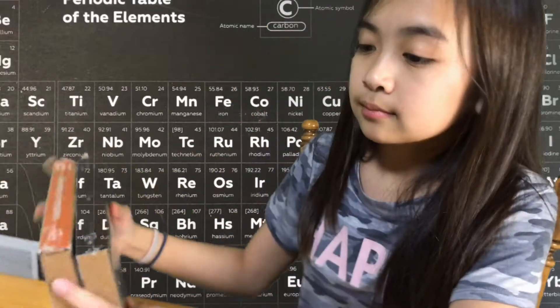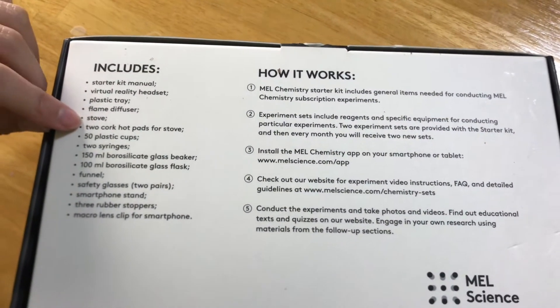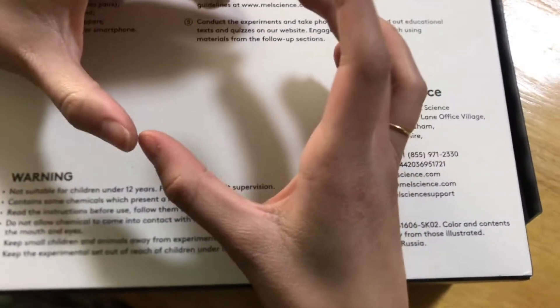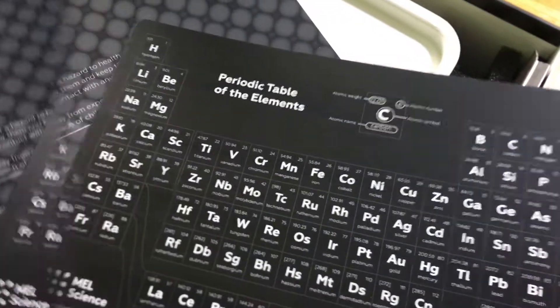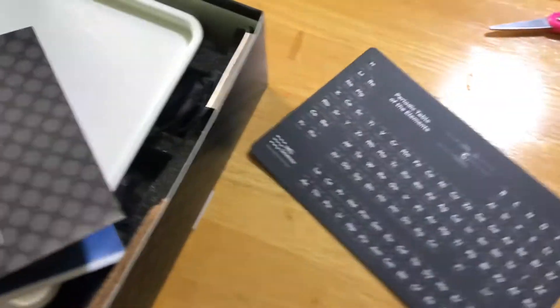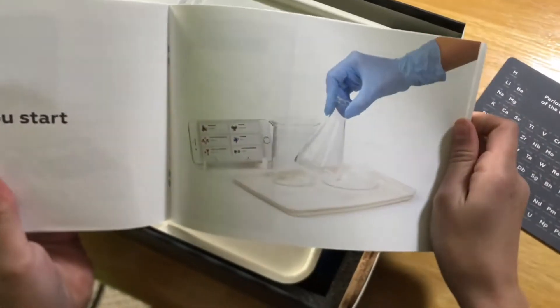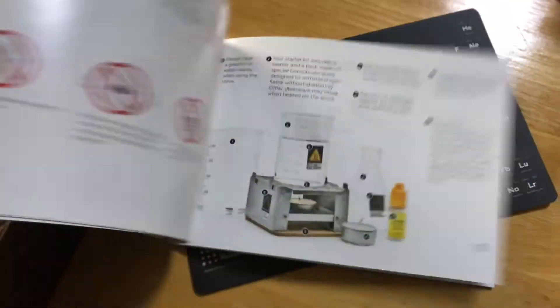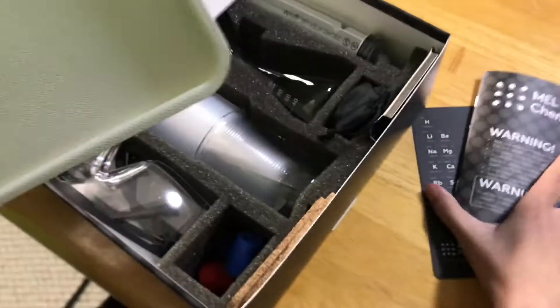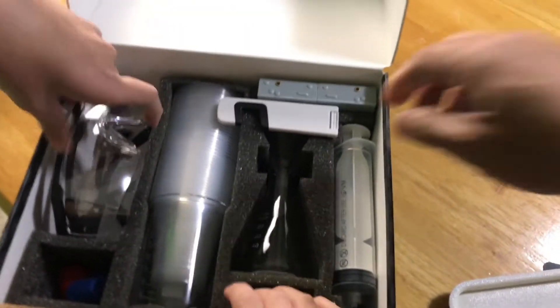Let's go with a starter kit. Includes: starter kit manual, virtual reality headset, plastic tray, flame diffuser, stove — it comes with a stove, isn't it a mini stove? It comes with a periodic table — I never know how to pronounce it, oh it looks like a keyboard. Manual. Before you start — oh, is there an app? I guess so. Look at the instructions, it's simple. This is so cool. Okay, so you have the tray — it's not foam, it's like plastic, it's hard. And then we have your top pairs of glasses. Oh my gosh, I feel so science-y.